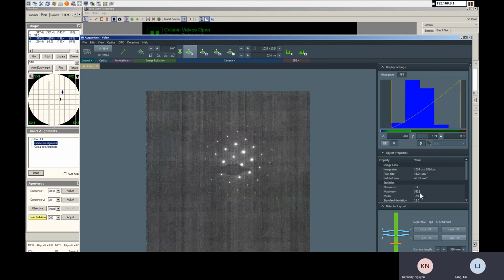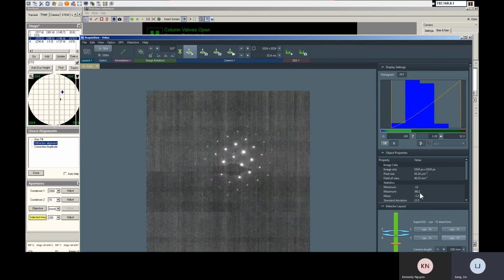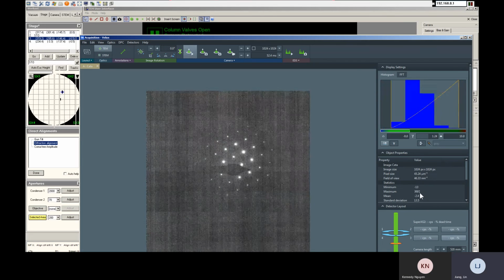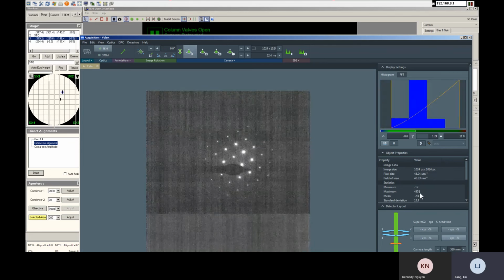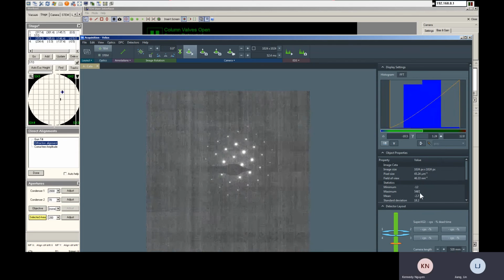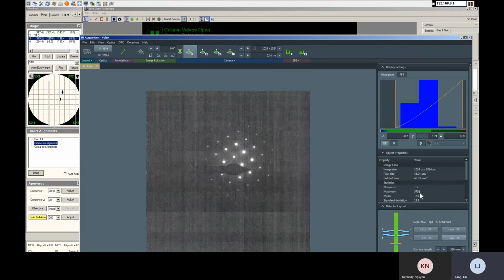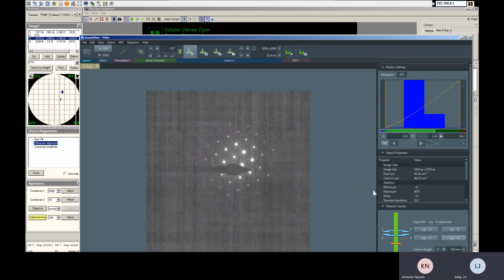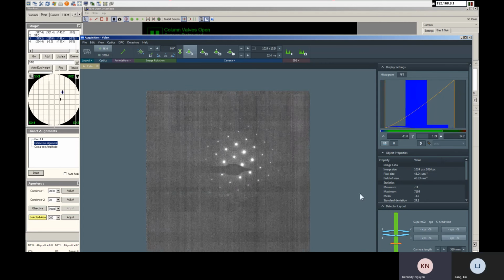Okay, because intensity is easy to do. I can just use a knob, right? I can do a minor increase. It's very common. You can do a live update right there, right? You can see that now. Tell me when you want to stop. Here should be good. Below 7,000 just to be safe.